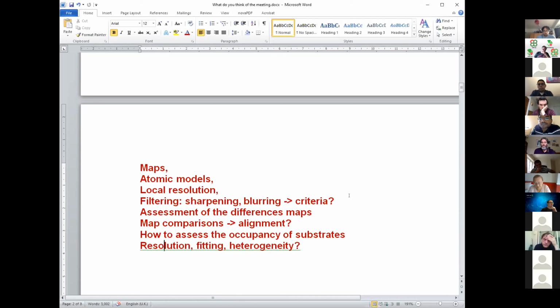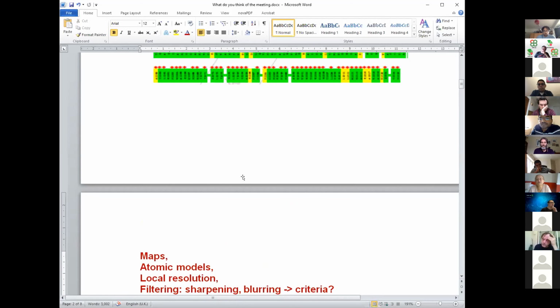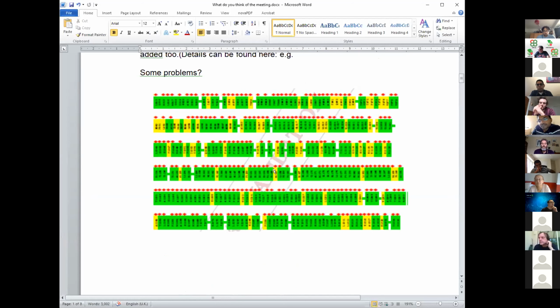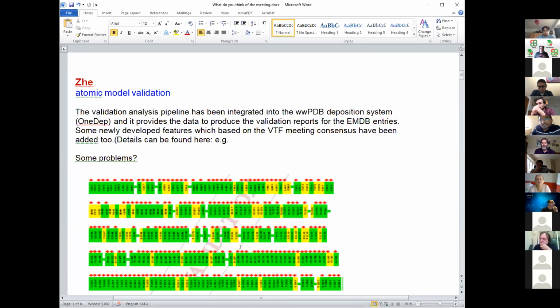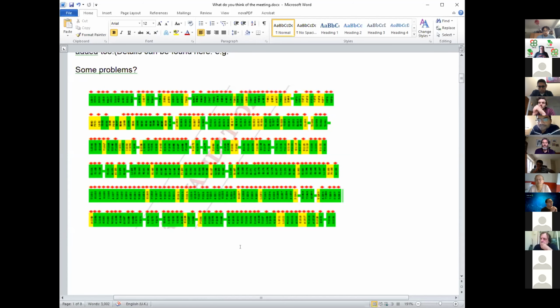Large amino acids have to be seen, but look, right now I cannot say all of them are out. I'm not saying small, big, whatever, all of them. What are the names of them? Is that all the yellow ones? All red dots mean that they are out of density. Is it one atom or the whole side chain? All of them. Oh, the whole thing. Okay, that's a lot. Yeah, that's Elena's point, that everything is out of the density.